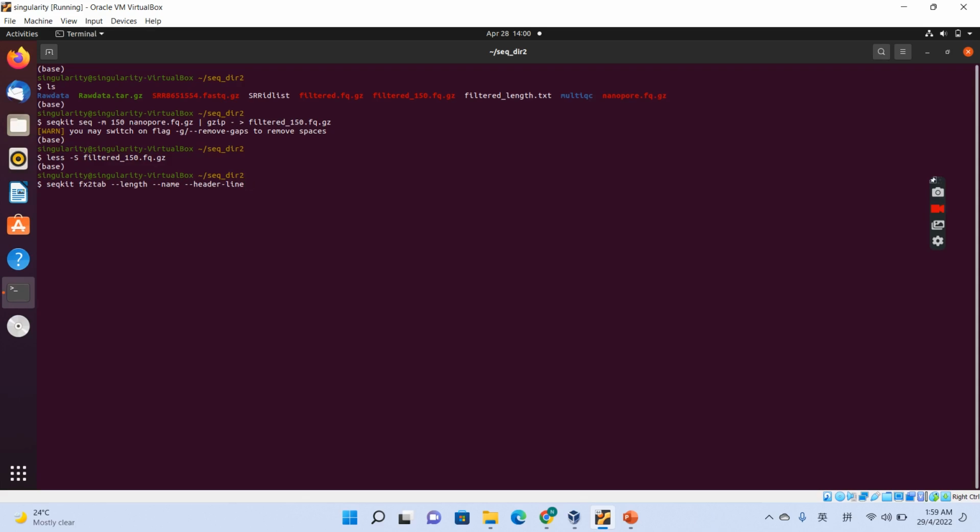And then from your filter, we put it in a file. Here I just put it as fxlength.txt and then press enter.